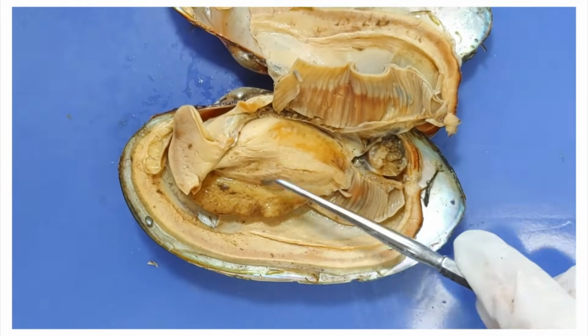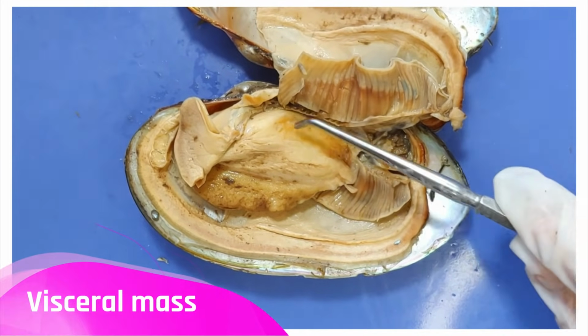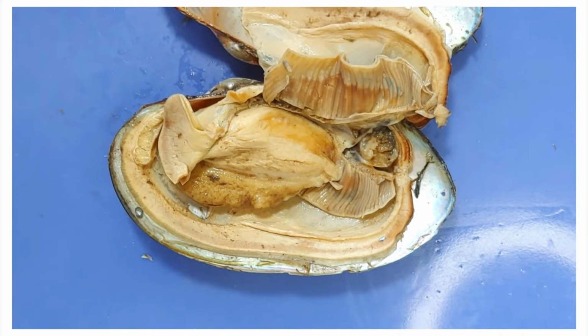Attached to the foot here is a large area that's called the visceral mass. Yeah, sounds gross, but it just means it's where a lot of the organs are. I'm going to use my scalpel to carefully peel back the skin from here.